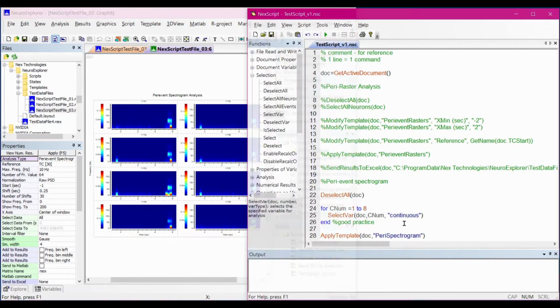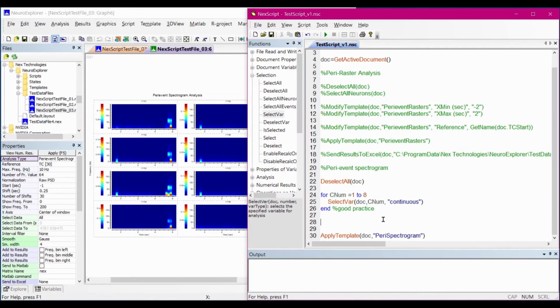So now I'm going to go back and set the parameters that I need for my data. And because I've done this before and I know my data, I'm going to actually set 10 different parameters. So I'm going to actually go ahead and copy and paste this.